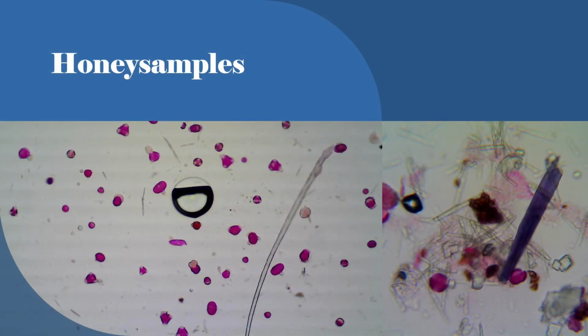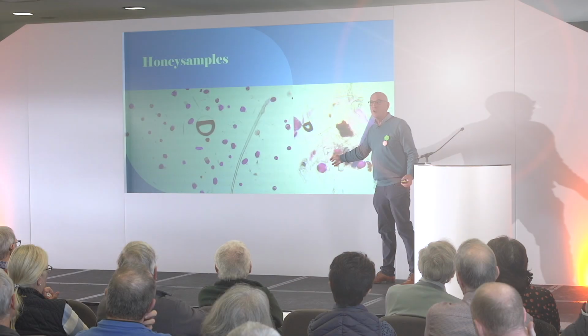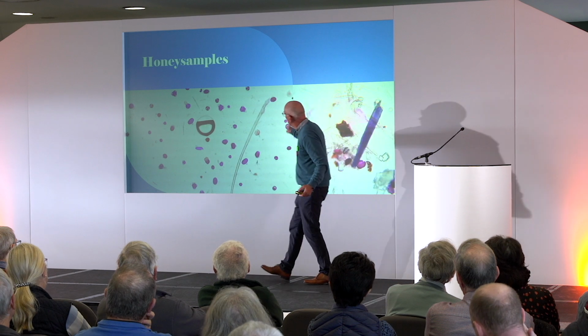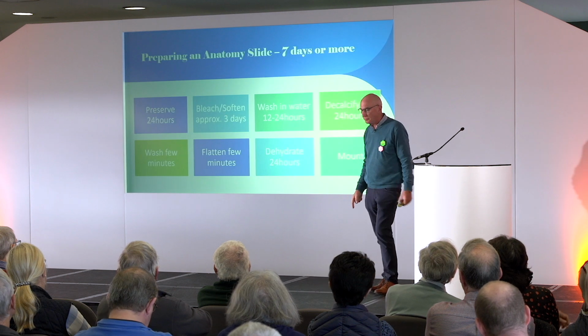And then this one came from Turkey. The region I go to in Turkey is a very big region for honeydew, and this is honeydew honey. But trying to work out, if you don't have a library, what all these different ones are in your honey is a very hard thing to do.